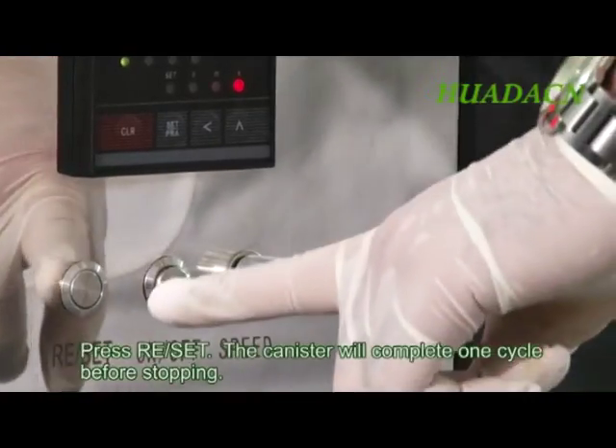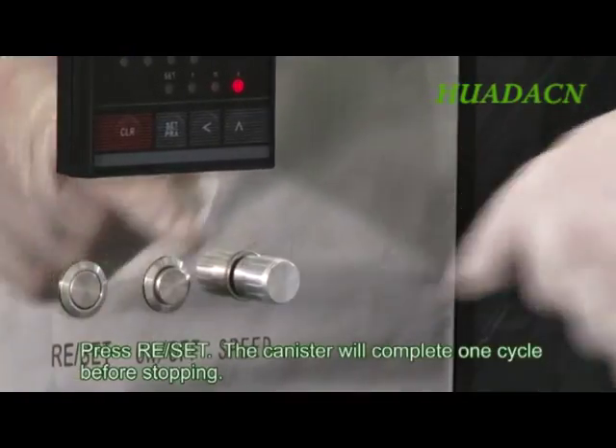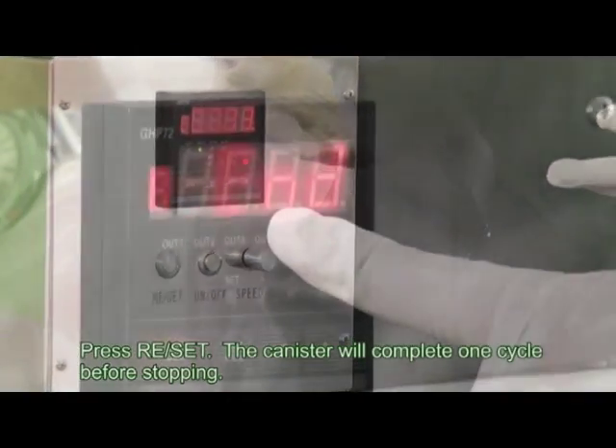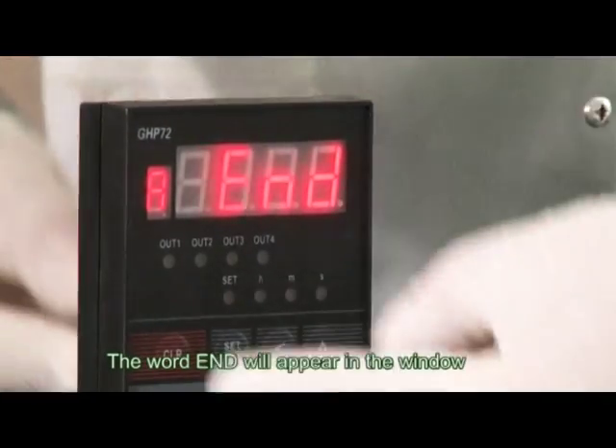Press Reset. The canister will complete one cycle before stopping. The word END will appear in the window.